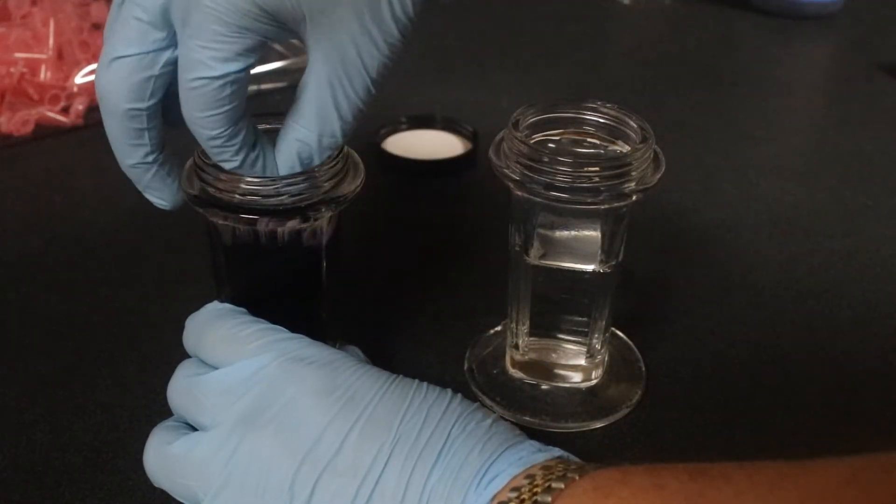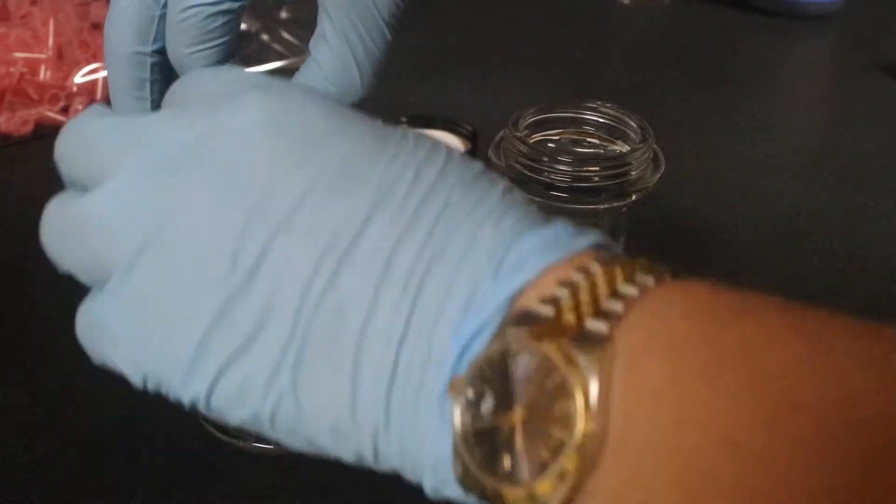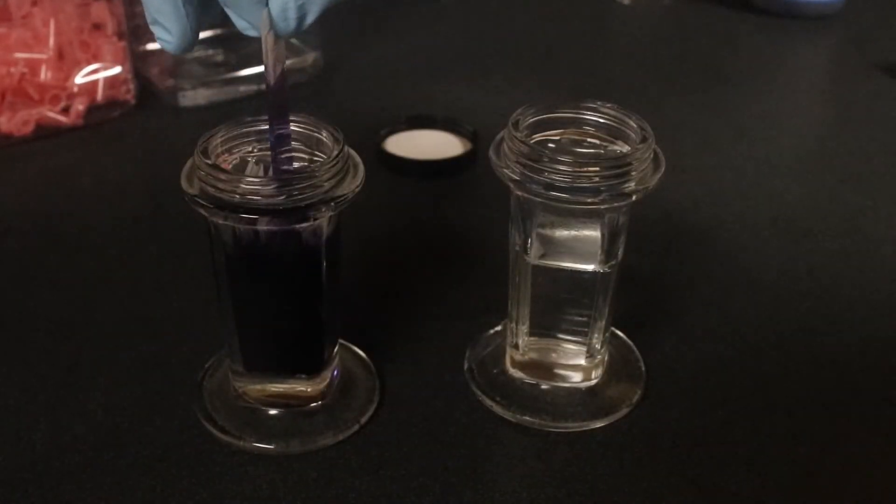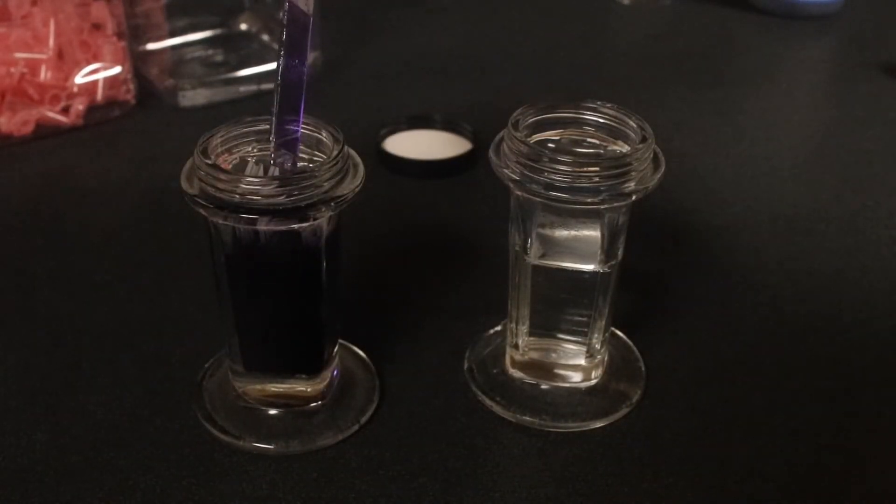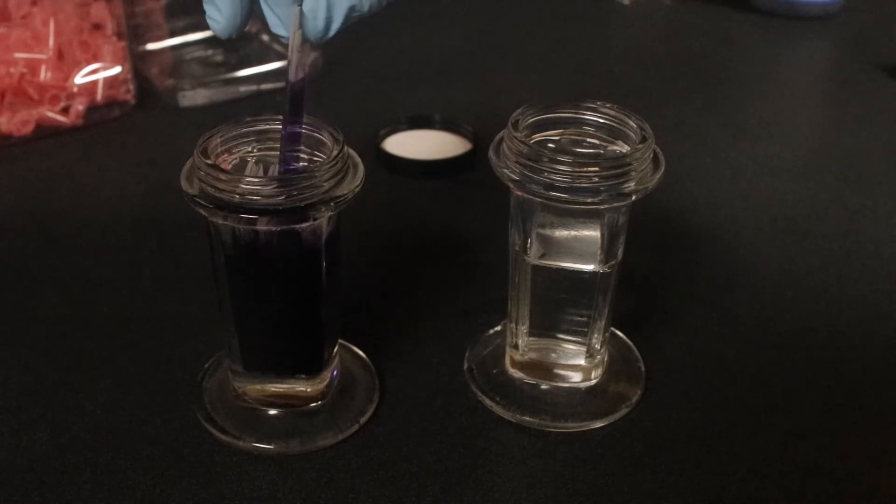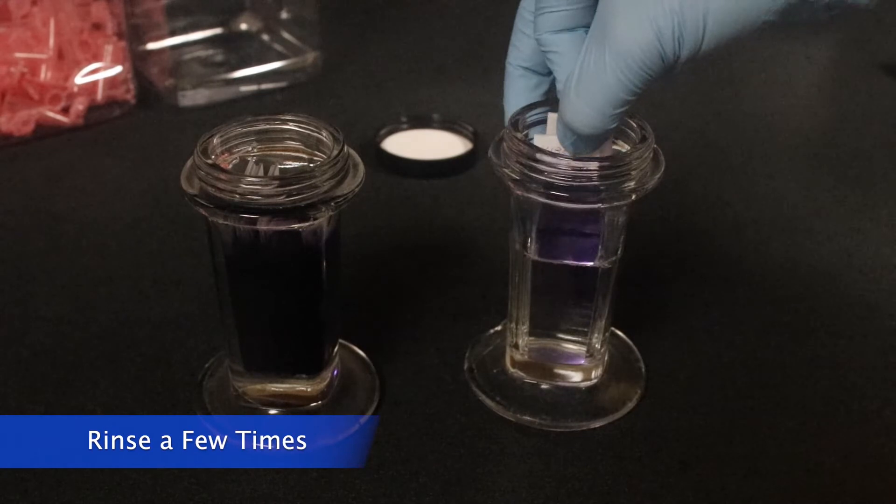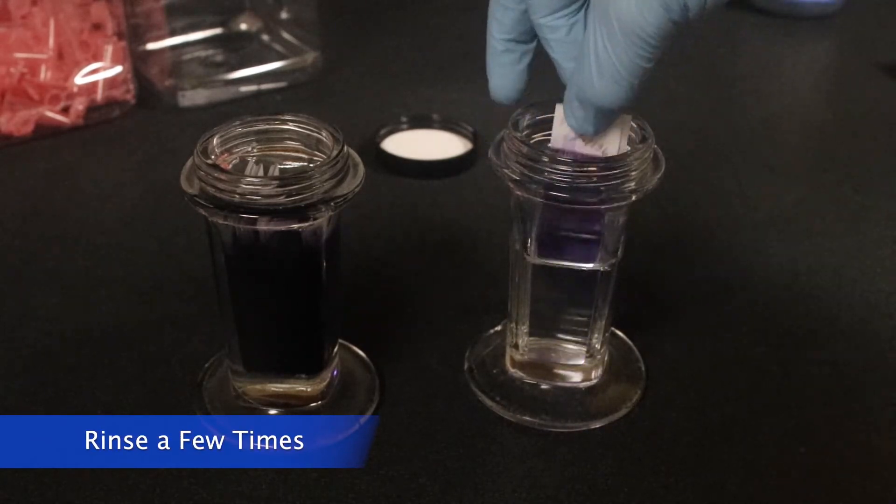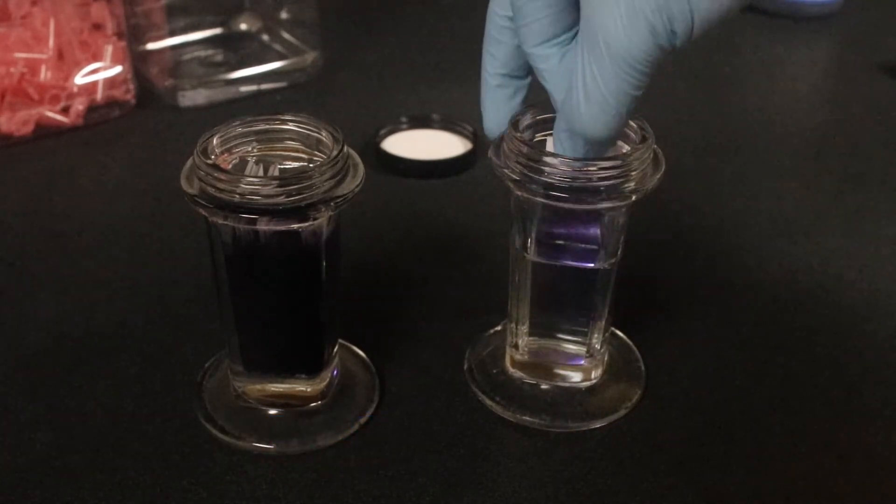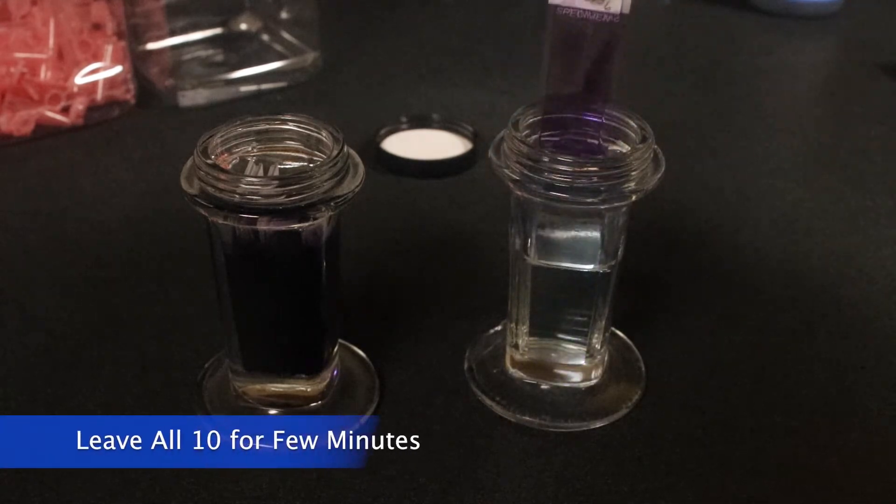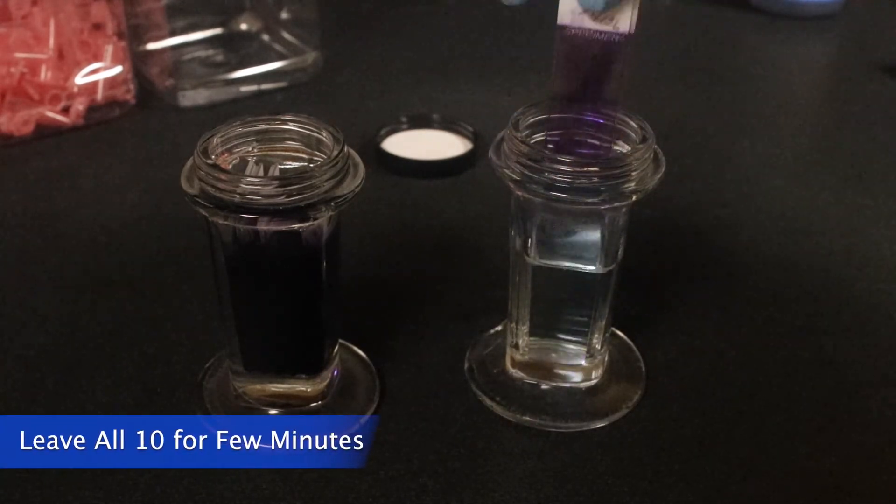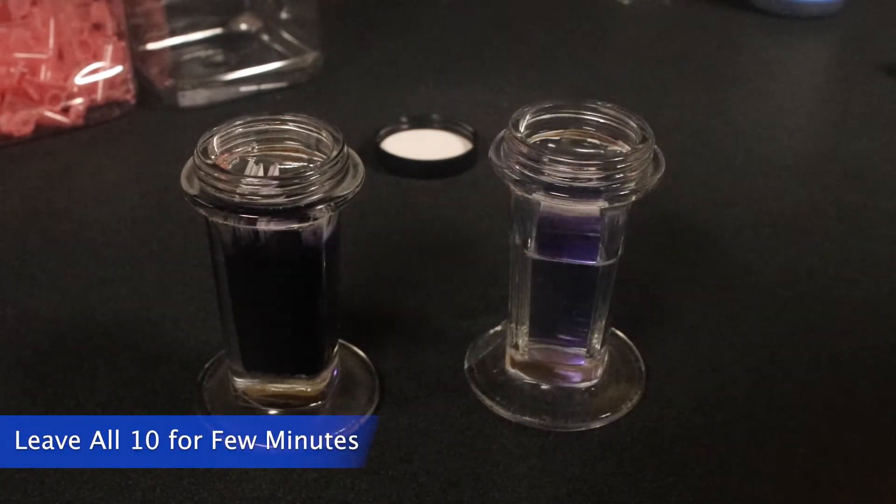So, we're going to put the buffer into a new Coplin jar, and from there, we're going to take out the slides from the stain and dip them into the buffer a few times to get some of that excess stain off of it. And we'll leave them in this Coplin jar for a few more minutes before it's time for a final rinse and to let them dry.